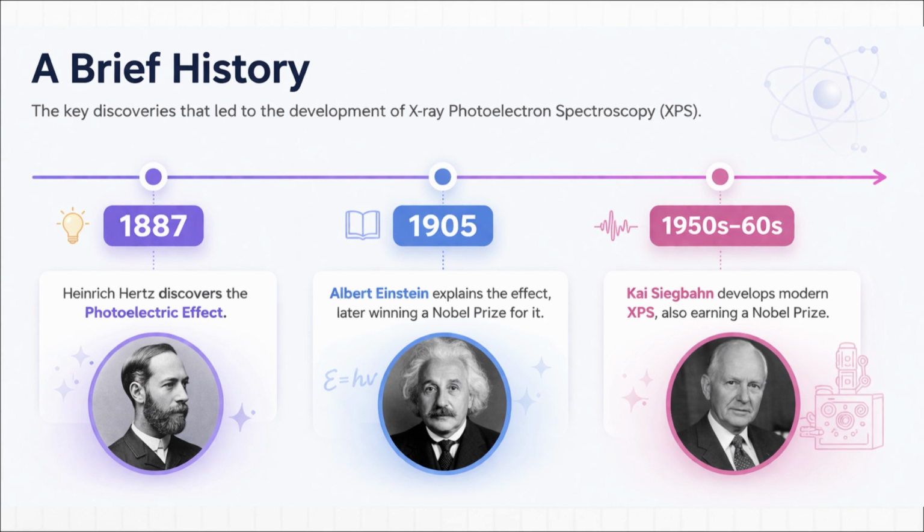Fast forward a few decades, and a guy named Kai Siegbahn brilliantly figured out how to turn that physics into the amazing analytical tool we have today. And yep, he won a Nobel Prize for it too. So this isn't some brand new idea. This is like a cornerstone of modern physics.